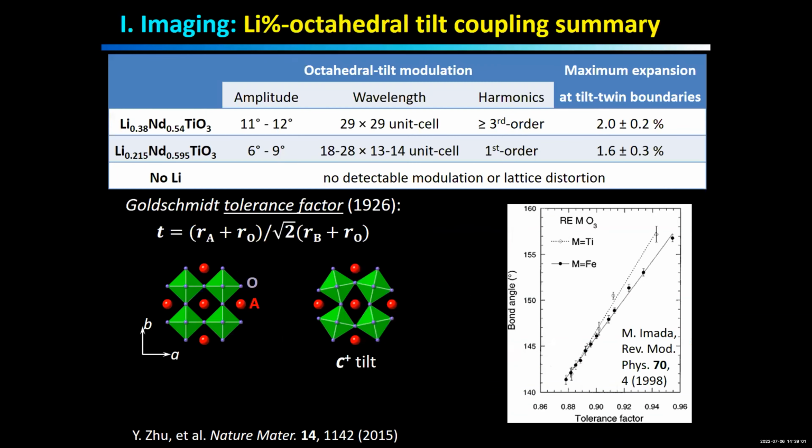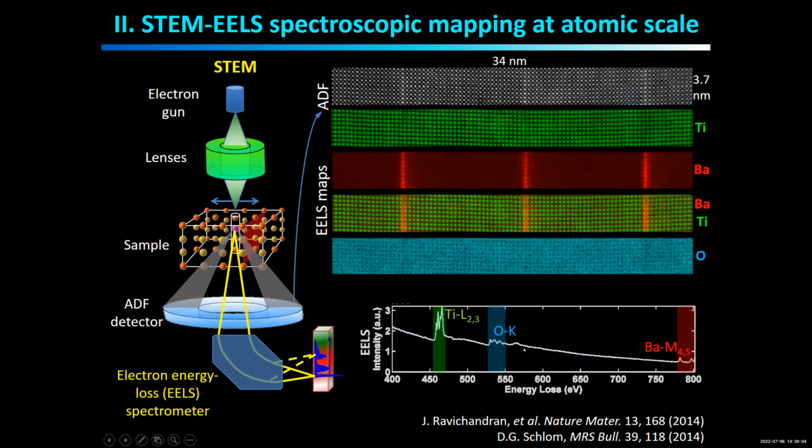So if we can do the EELS mapping at the atomic scale, we can still be able to distinguish carbon and oxygen. They have very different characteristic peaks. So that's a way to do it. The spectroscopy instead, right? Okay. Yeah, spectroscopic mapping. So is the material you're looking at a single layer material?